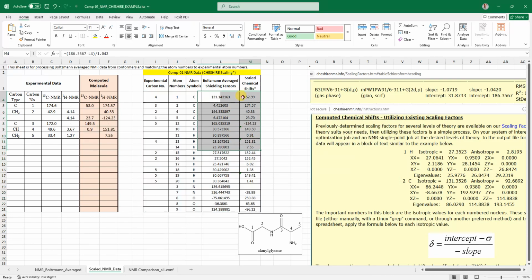And so now I will make sure that all the carbons have the same formula for them. So I'll just copy this formula to carbons, and then the hydrogens should have the formula of hydrogen, which is this one. So I'll just copy it here. So you can see that the hydrogens will get the same formula now.